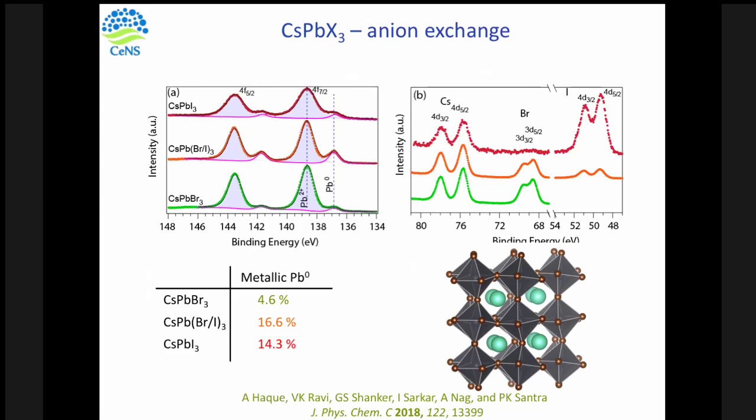Okay, that's interesting because I've done standard XPS where you just have a fixed photon energy, and you're basically scanning to see what's there, what the oxidation states are, like you talked about. But it's a fixed depth basically. So yes, that's an interesting technique. Actually, before the synchrotron development... Now synchrotron has been developed a lot over our research time itself.